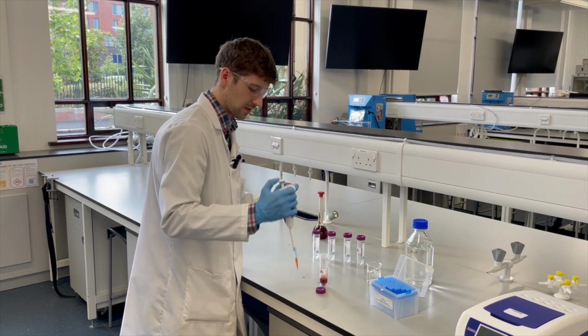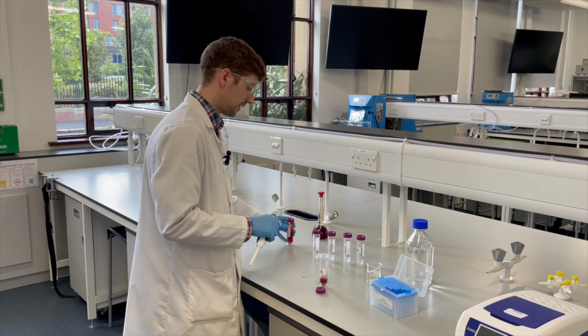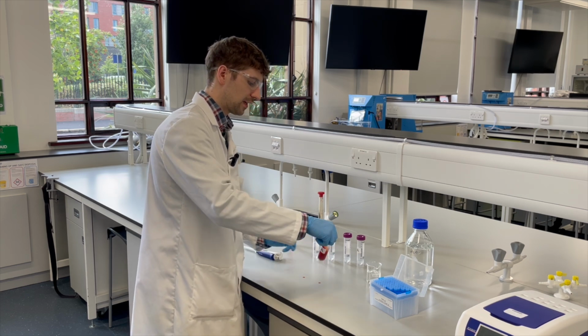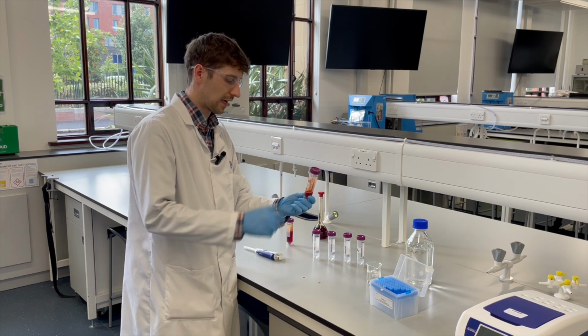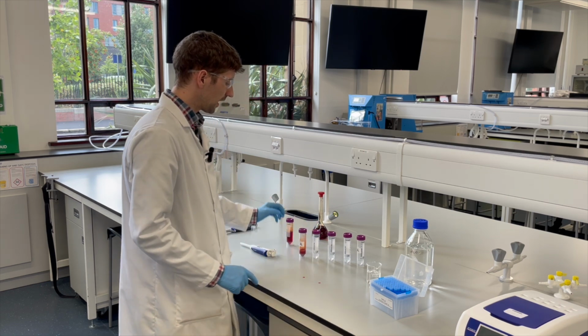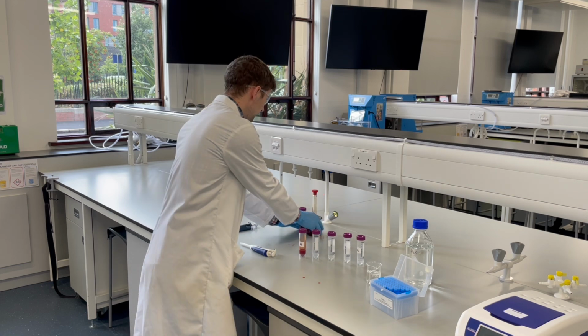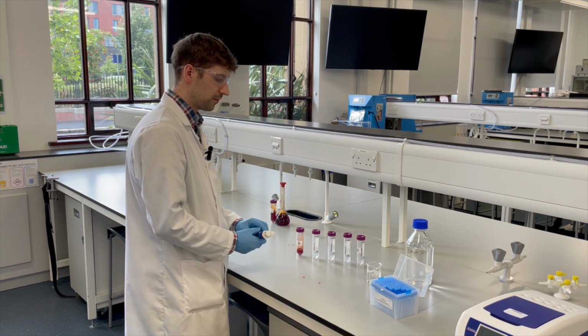Okay, and I'm going to just dispose of my pipette tip, put the lid on, and just give it a little bit of a mix. All right, so nice. We've got 4 mils now. 8 mils of concentrated stock. Now, what I would do is, this is the concentrate. I would put it aside, okay, and now I'm working with this new volume, all right.